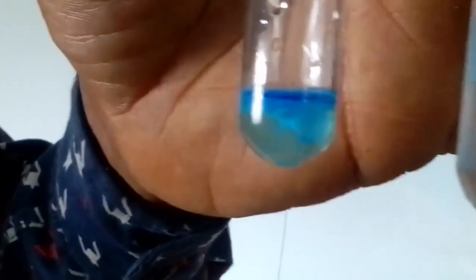How do we carry out the experiment? We add ammonia, a drop at a time, into this. To get the drop exactly, I'm going to use a dropping pipette to collect 1 or 2 drops. I'll press the rubber end, so a drop has entered. If you look at the brim, you're going to see a gel-like solid formed. That gel-like solid is pale blue in color. It's called a pale blue precipitate. The word precipitate means a solid formed when 2 solutions are added together.